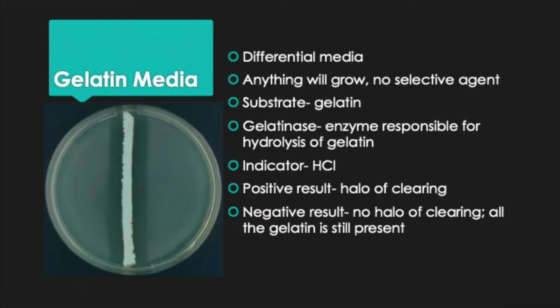If the bacteria can produce gelatinase, that will break the gelatin down, and then the bacteria will take that in and use that as a nutrient source. Basically it can eat the gelatin. Some bacteria can do this, some can't. So we are going to inoculate gelatin media, incubate it for 24 hours, and then we're going to see if the bacteria can eat the gelatin, yes or no.